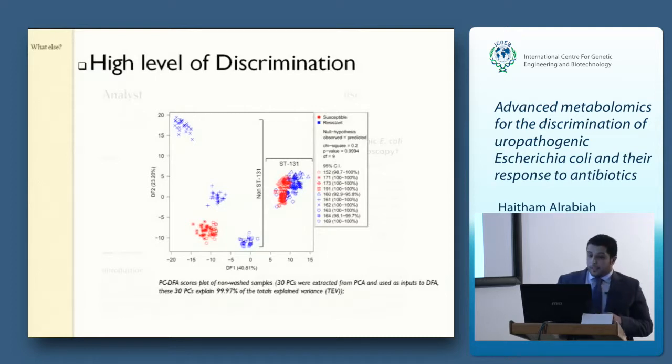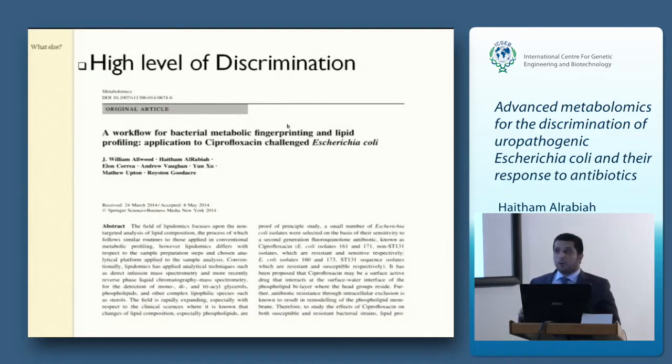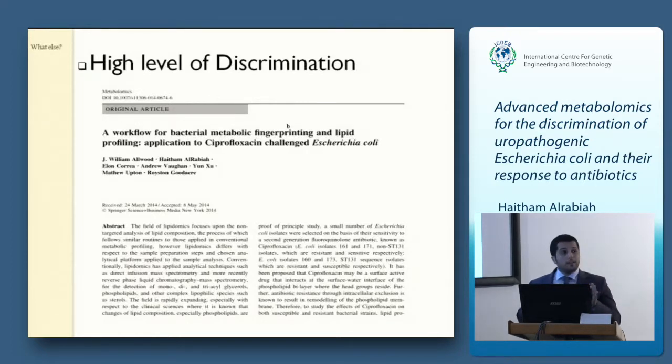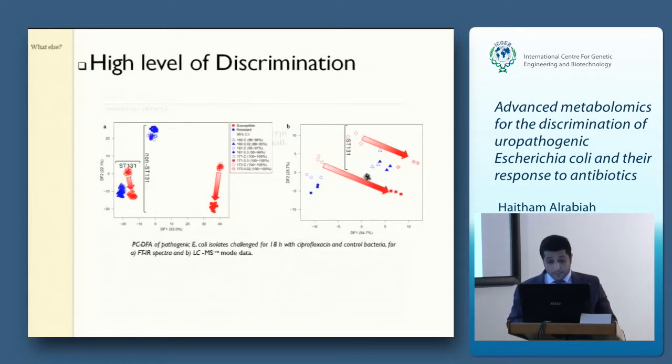Then the previous approach was applied in another study that aimed to have a reproducible workflow for lipidome analysis using LC-MS. We observed a similar discrimination between FTIR spectroscopy and the negative mode of LC-MS in terms of distinguishing samples. But this needs further investigation with a large number of samples, and that's what we made in the next experiment.